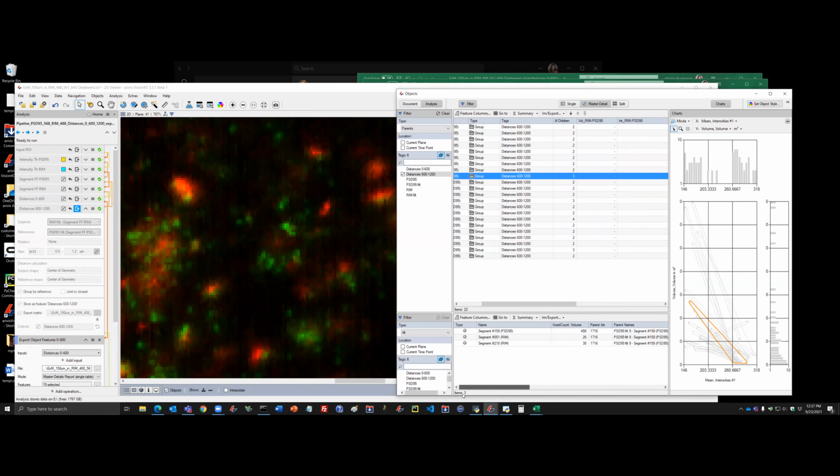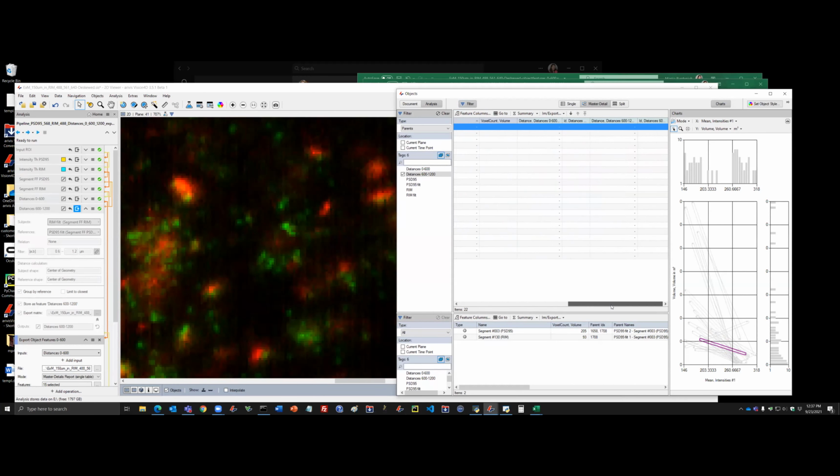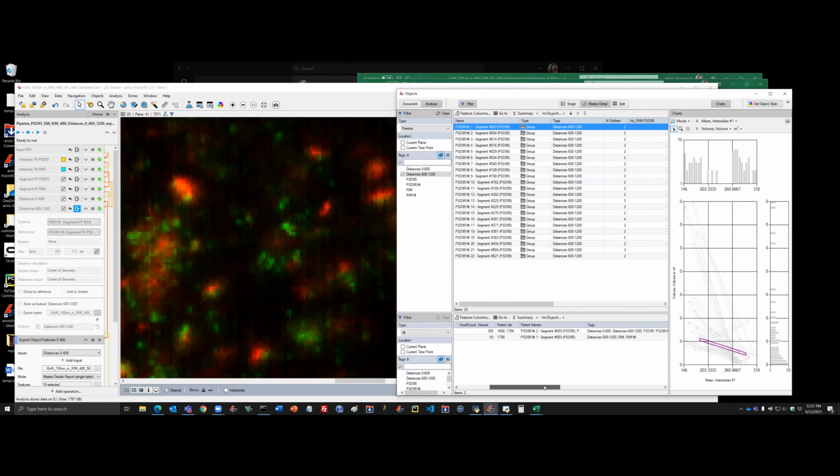So as for each of the columns, let me show you how to do this. If the column is not populated, it means that the data is not accessible for this kind of computation. But let's create a new one.